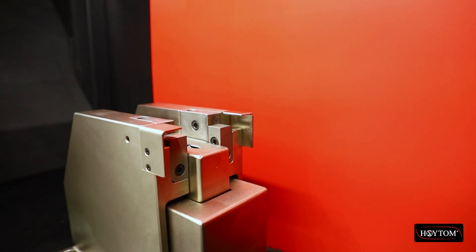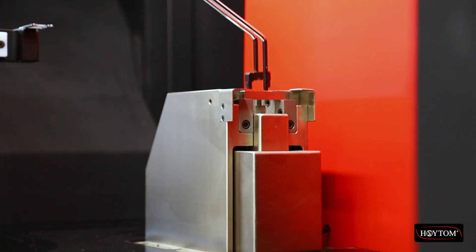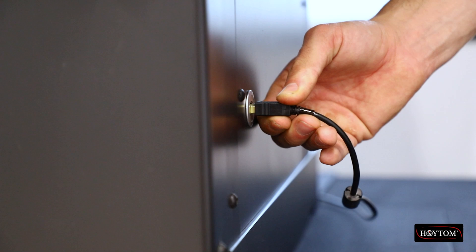The Charpy Automatic Test Specimen Centering device for Oytom's Heat range of pendulums facilitates fast and precise specimen positioning, thereby shortening the time between tests. The touchscreen facilitates intuitive operation and quick reading of test data.